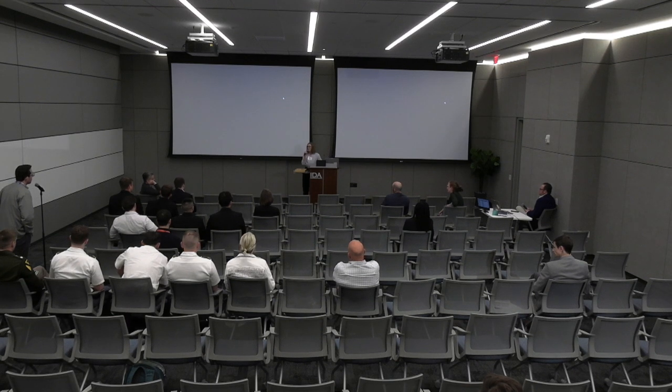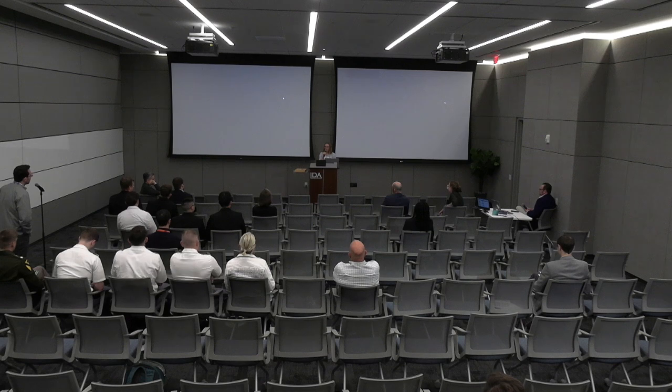Yeah, thank you. What's your name? Adam Watts. Adam, thanks for that. So that's part of the process we're dealing with in creating this GUI. We want it to be accessible but still strong for practitioners. Part of that is by having the processes of the algorithm available for them to see. For instance, we'll have the acceptance criteria available within the MCMC, and they'll be able to see what that percentage is to see if it's performing as we need. But that is another consideration.